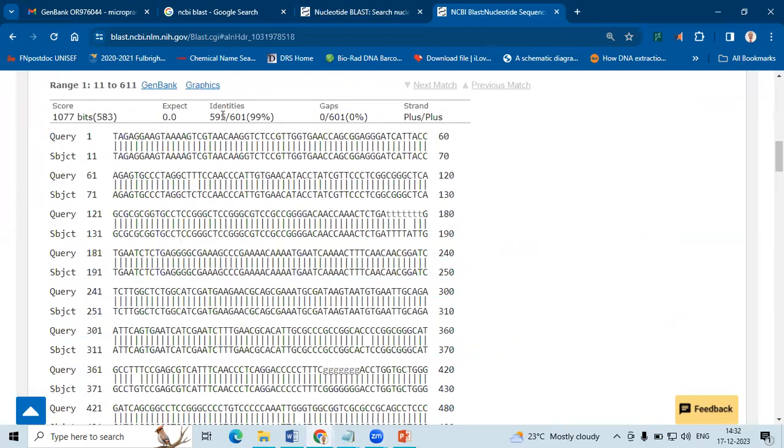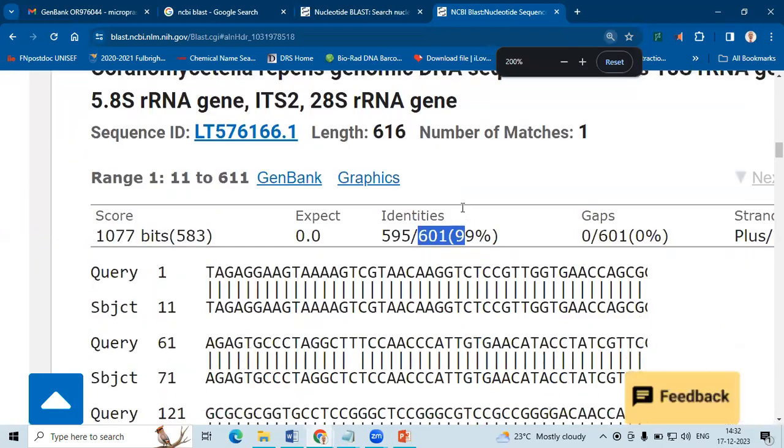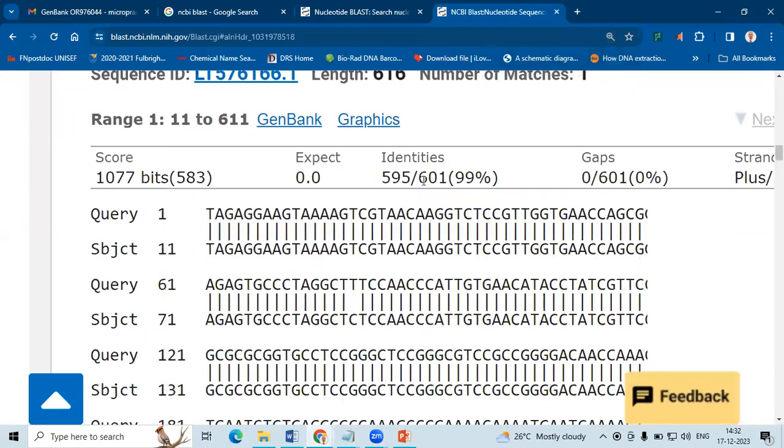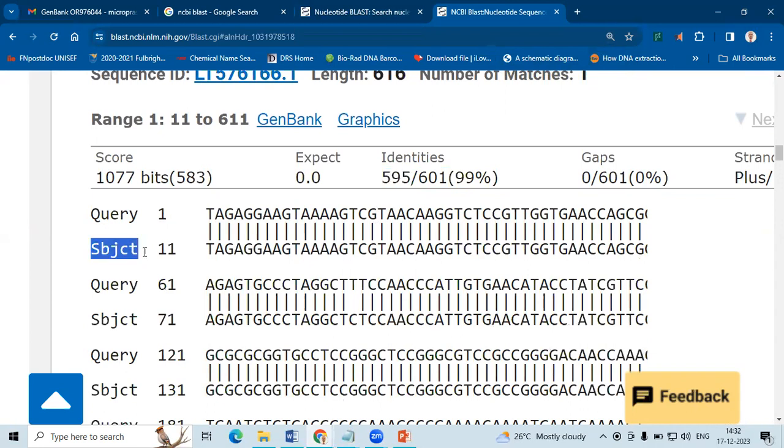So out of 601 base pairs, 595 base pairs has found the exact match to the subject sequence. Here the subject is the sequence present already in the database. Query is our sequence.